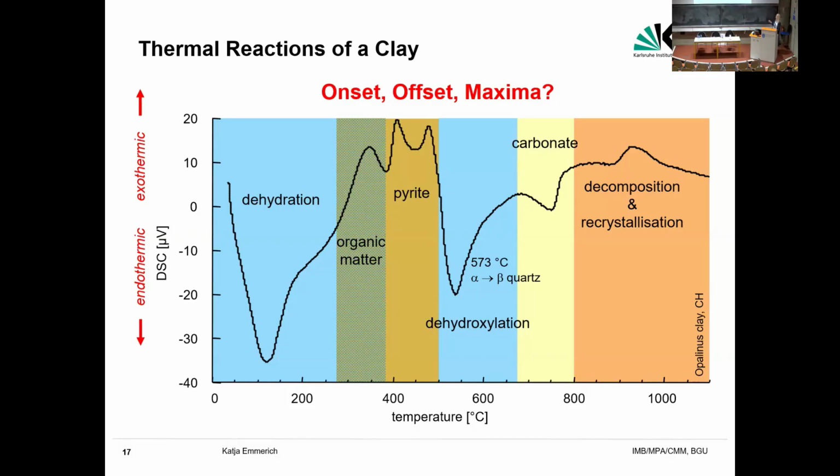So, and here you see, if you don't have any experience, you don't know if those are 2 endothermal reactions that are superimposing, or if you see 3 exothermal reactions that are superimposing. So you just have to believe me, and that I tell you, okay, these are 3 exothermal oxidation reactions. Okay, and these reactions are followed by the dehydroxylation of the clay minerals.